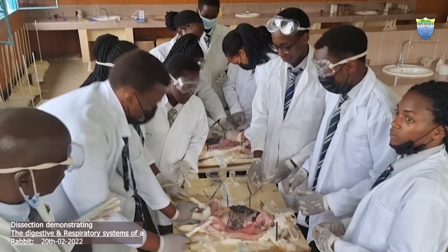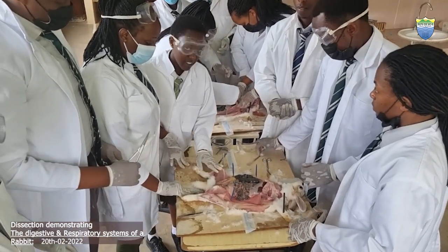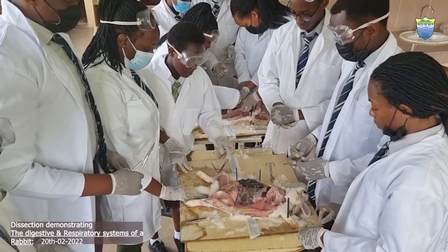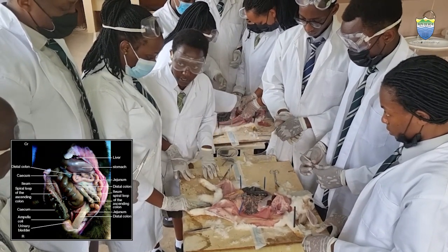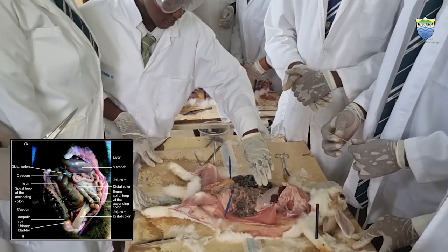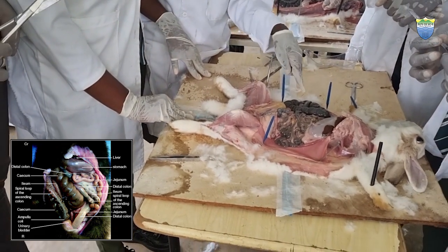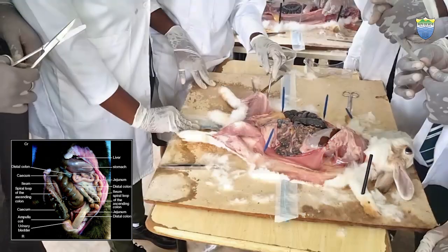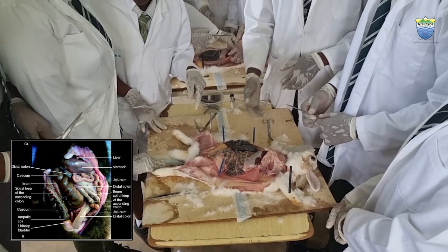So far we have opened up the internal part of this rabbit, particularly the digestive system, whereby here we have the large intestines and here we also have the small intestines. As you can see, the large intestines are much bigger than the small intestines, and it's usually also called the ileum. And why are they bigger? Why do you think they are bigger than the small ones?